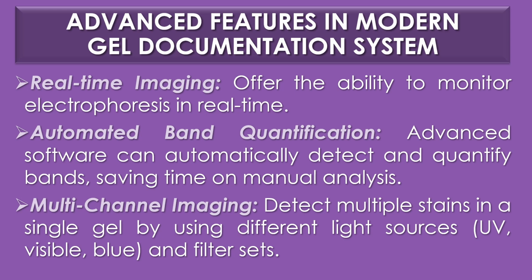Advanced features in modern gel documentation systems. The first advanced feature is real-time imaging. Some systems offer the ability to monitor electrophoresis in real time. The second advanced feature is automated band quantification. Advanced software can automatically detect and quantify bands, saving time on manual analysis.